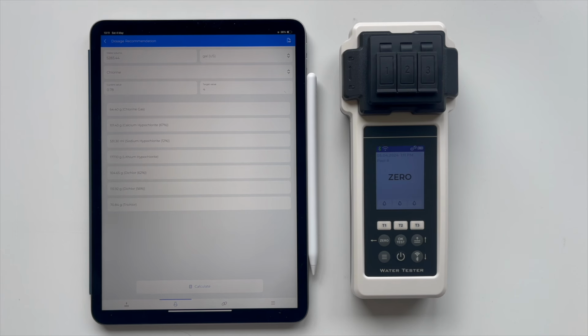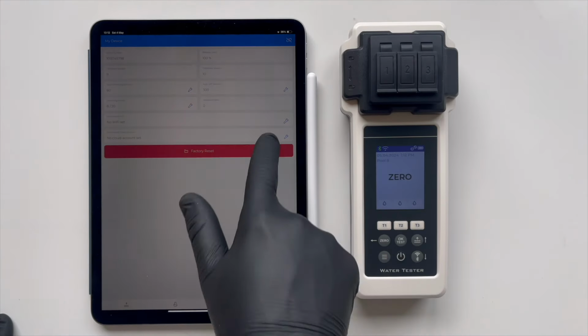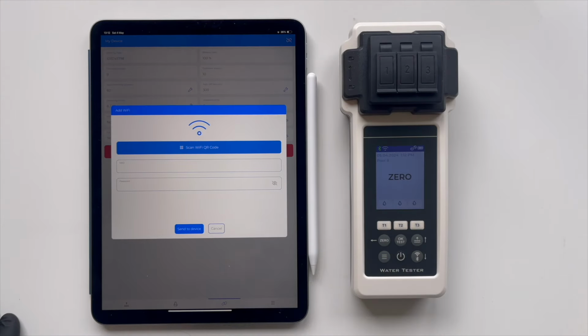These are key points for using the tester via Bluetooth. Next, we will show how to use the tester through Wi-Fi and cloud storage. Let's move to the Connections menu. We need to set up a Wi-Fi connection to enhance the functionality of our device. By connecting the device to Wi-Fi, we enable it to communicate with cloud storage, allowing for the synchronization and backup of data automatically. Click on the wrench icon on the Wi-Fi option.